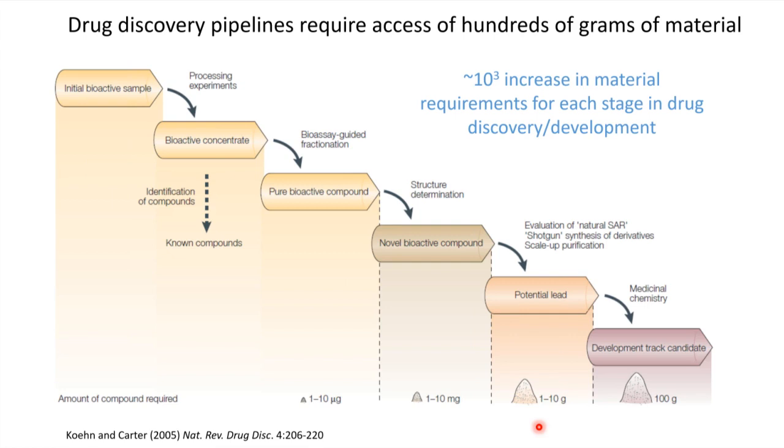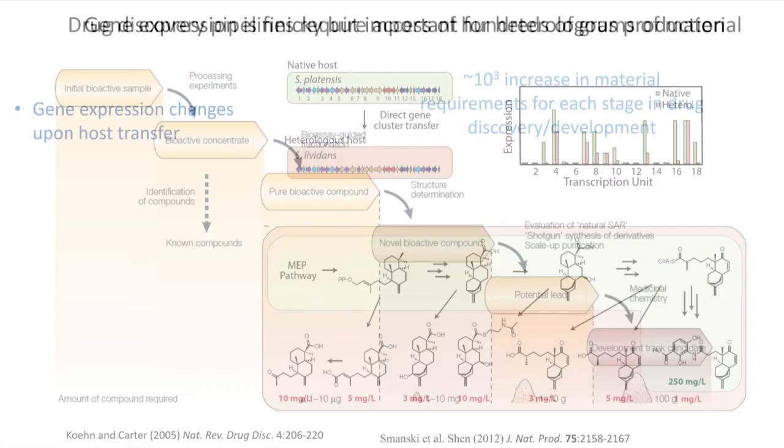And this is an area that I think high throughput DNA assembly and the ability to rapidly build and test alternate genetic designs in your heterologous host can really be leveraged to increase the titer of a molecule of interest relatively quickly. I'm going to make a few points to justify that claim, using cited examples in the literature.